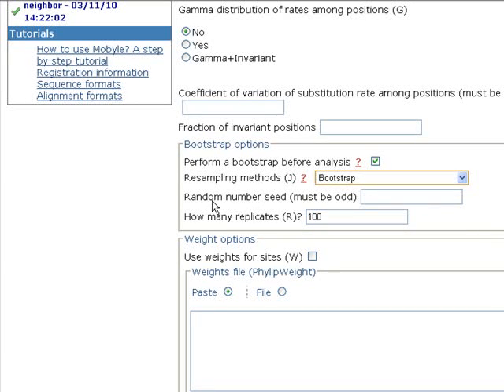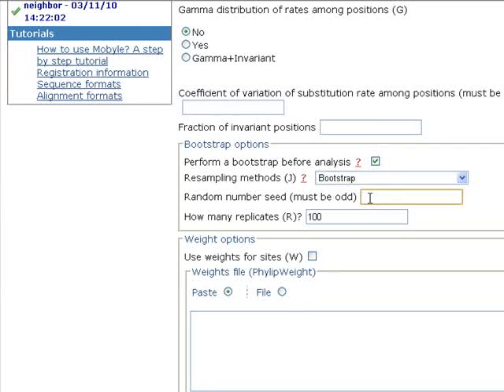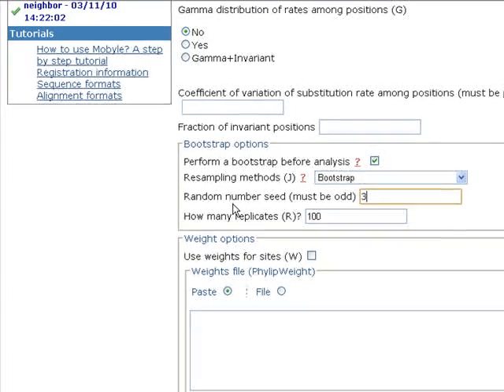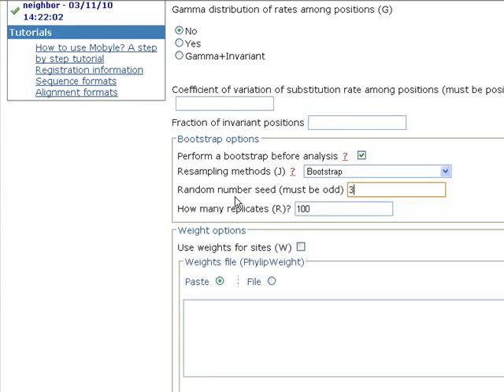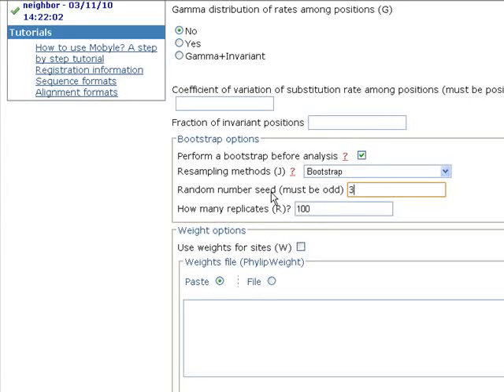And here we choose bootstrap in the random number seed. And it says here that it must be odd. We write three, for example. And the seed controls the generation of random numbers during the bootstrap, because it generates random numbers during the bootstrap.